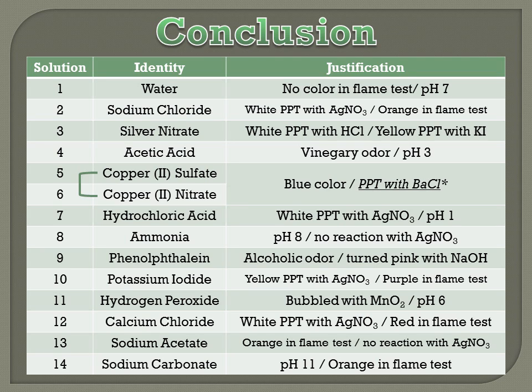This lab can be completed many different ways because there are so many different physical and chemical properties that can be tested to differentiate between otherwise identical solutions. However, one must take caution in areas of the experiment in which error may occur. Reading the litmus strips to determine solution pH is especially difficult due to it being mainly based on human judgment. If the pHs were inaccurate, conclusions may be misled and in turn impact the reliability of the entire experiment.